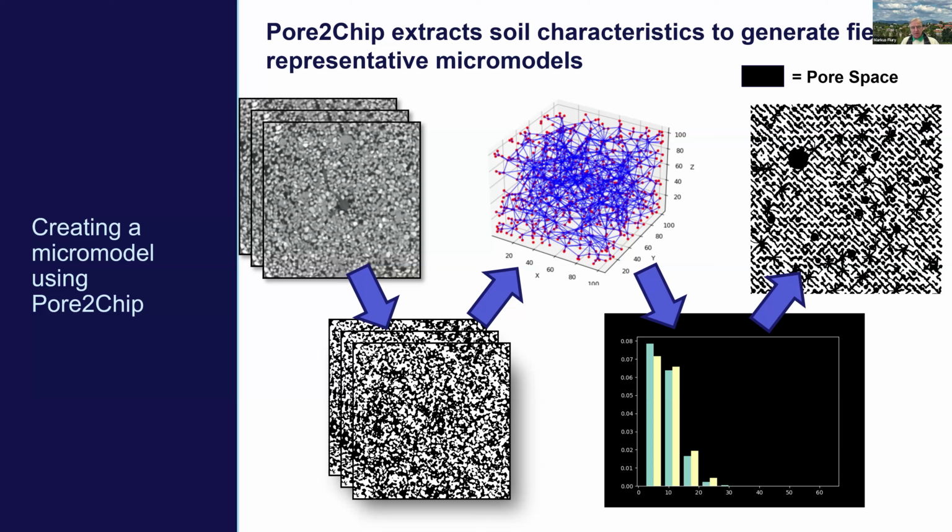The other thing I was wondering is what the impact is of the size, in terms of representative volume, that you do those segmentations on. Because in Brian's simulation you had these dead end pores, right? Of course you don't have any flow there. But if you were to make the size bigger, those dead end pores may be connecting again, right? And then they would actually contribute to the flow.